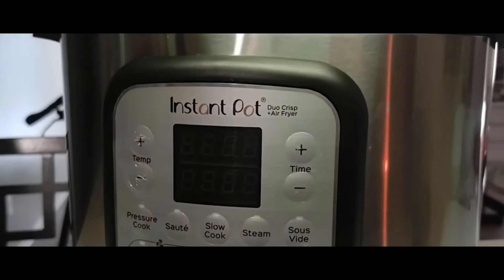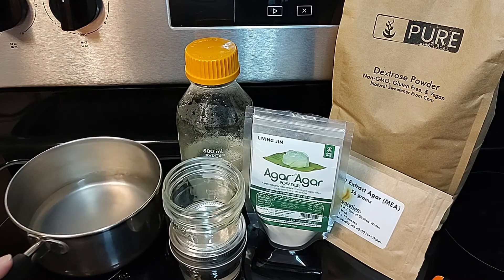Pressure cook for no longer than 20 minutes at 15 PSI, so you don't caramelize the sugars or overcook the nutrients.